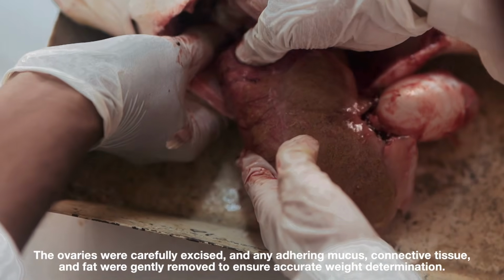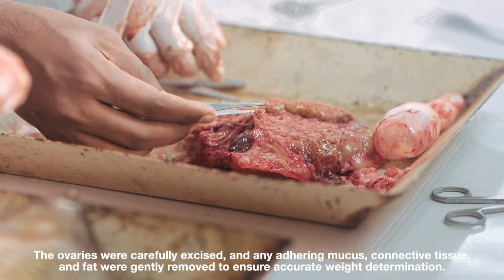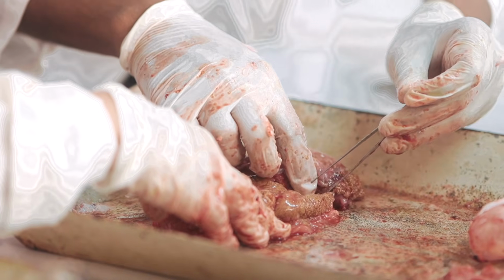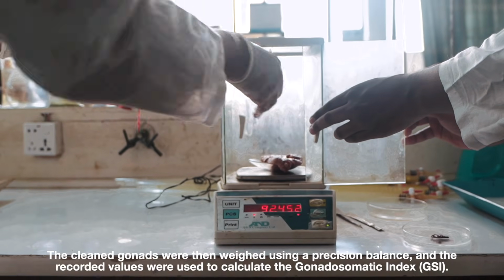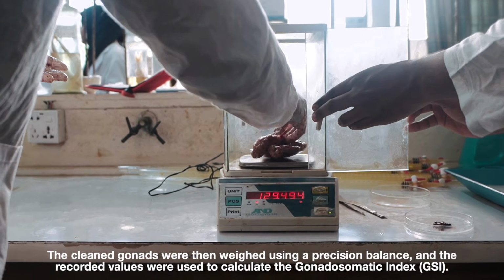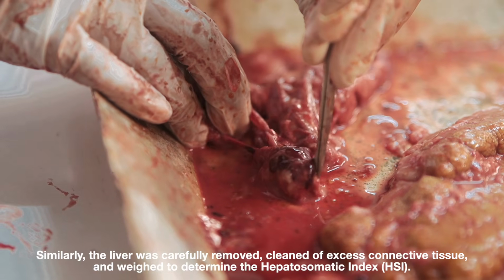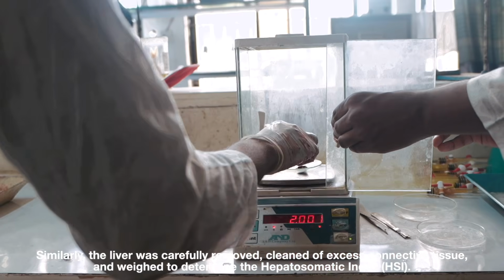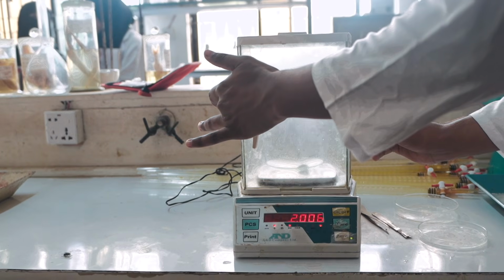The ovaries were carefully excised and any adhering mucus, connective tissue and fat were gently removed to ensure accurate weight determination. The clean gonads were then weighed using a precision balance and the recorded values were used to calculate the Gonadosomatic Index or GSI. Similarly, the liver was carefully removed, cleaned of connective tissue and weighed to determine the Hepatosomatic Index or HSI.